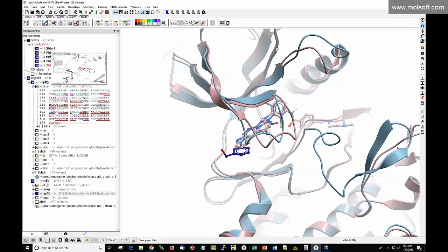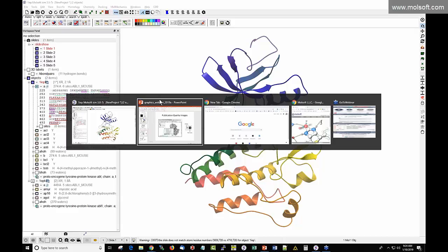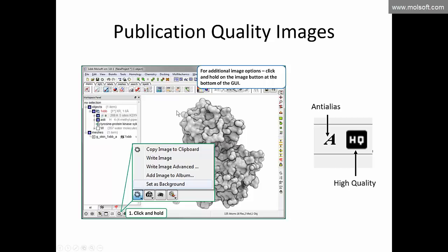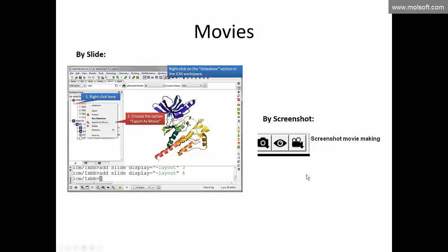To make images, click-and-hold the button next to the slide button. Options include 'copy image to clipboard' (then paste into PowerPoint), 'write image' (automatically writes a PNG to your desktop, named ICM1, ICM2, etc.), and 'write image advanced.' For high quality images, ensure the high-quality and anti-aliased buttons are enabled. A single click copies to clipboard.